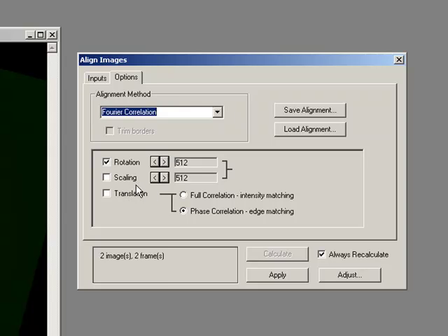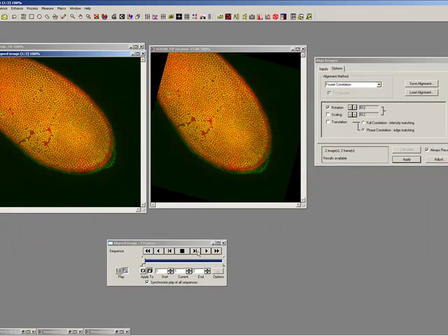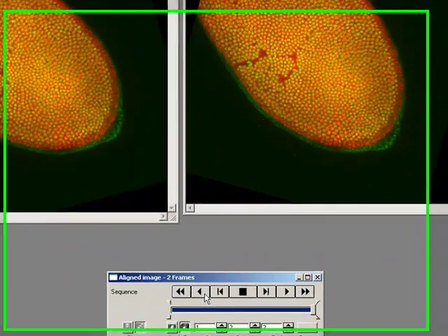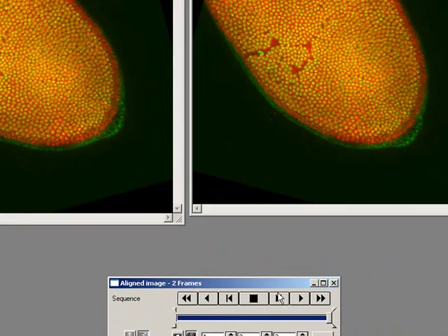I can select the others as well but we don't have any problems with scaling or translation in these images. I'll just press apply. Now I've got an image where I've got two images that overlap on top of each other.